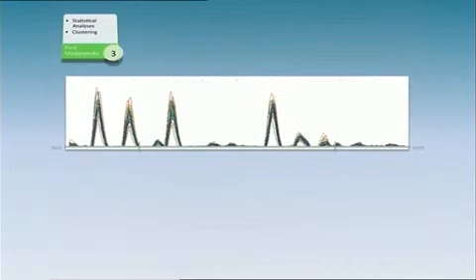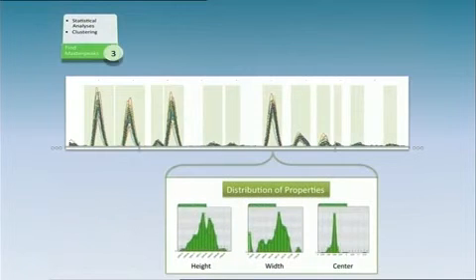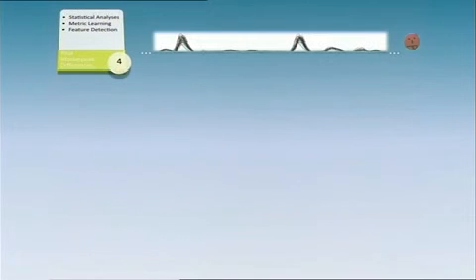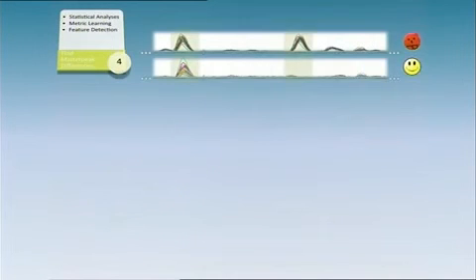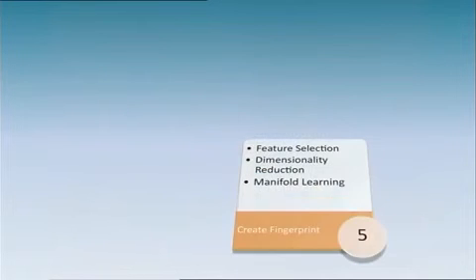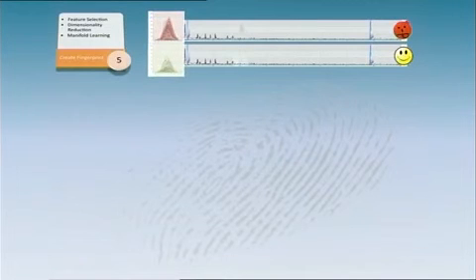During the next step, the researchers overlay spectra of many patients having the same disease. They are searching for so-called master peaks, which occur in all spectra simultaneously and have similar properties. Eventually, the properties of detected master peaks are compared to those extracted from the data of healthy people. That way, features specific to a certain disease can be identified. The collection of particularly distinct features provides the researchers with a fingerprint for this disease.